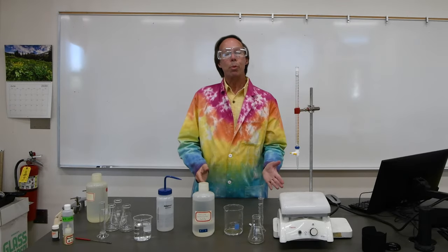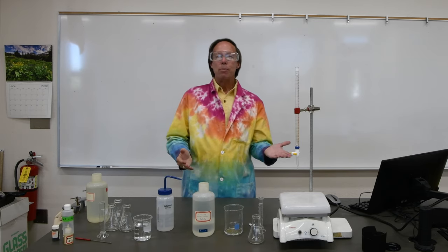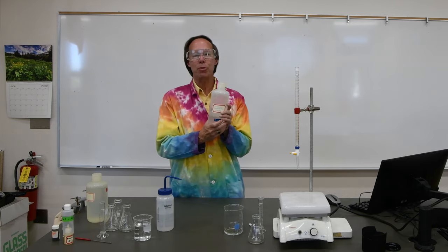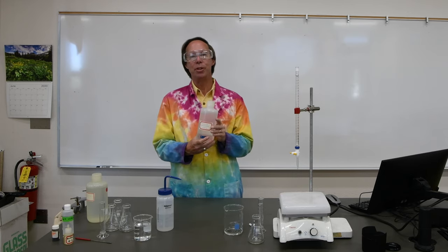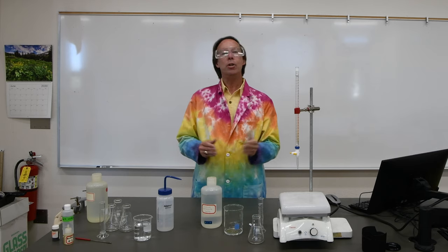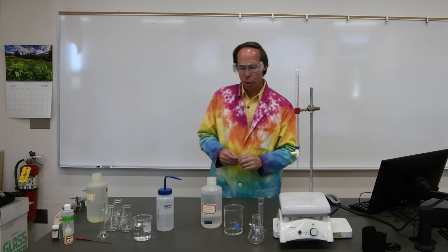The next step is to prepare a sample of an unknown. Since this is your first time doing a titration, we want to begin with a sample of calcium whose concentration is known. This particular calcium, this is our standard hard water sample, it's supposed to be 250 parts per million of calcium. And with the concentration of EDTA, it should require just a little bit more than 6 milliliters of the EDTA solution to neutralize it. So we're going to check and make sure that we can do the titration correctly by getting that value, or at least close to it.